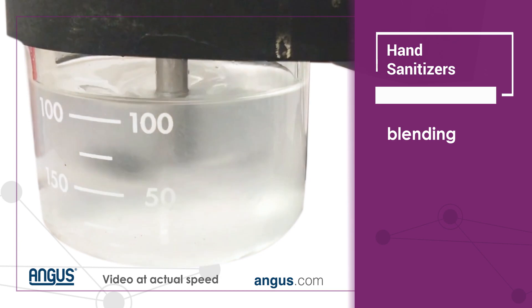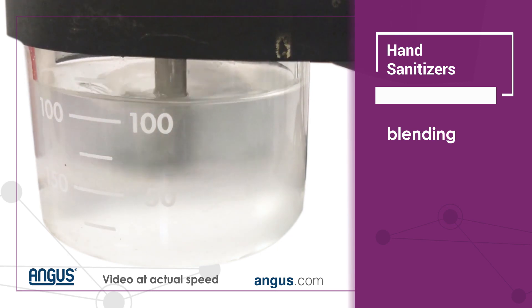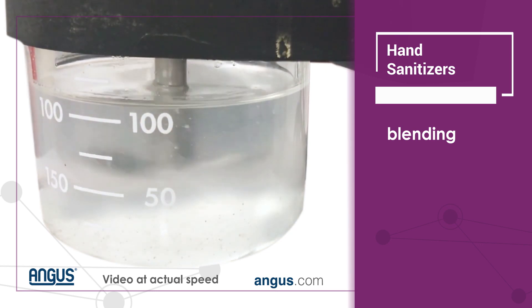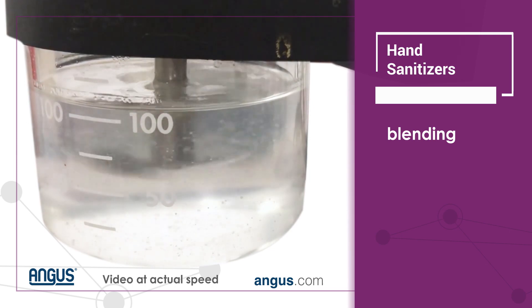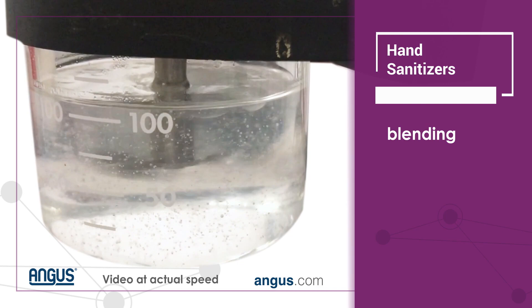From here we move on to adding the AMP UltraPC-2000. It is added drop by drop until a pH of 7 to 7.5 is achieved. It is important to take note of the weight added so that the final formula percentage of AMP can be calculated to be used in larger production batches.